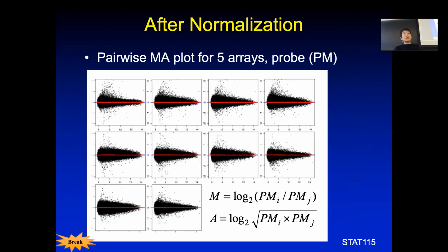Yeah, so questions? Yes. When we normalize across samples, do we need to have the same number of probes? Yes. With Affymetrix, the early Affymetrix and later Affymetrix arrays have different numbers of probes on the same array. Their locations on the array are also different, and depending on the location, their signals change a lot. People have tried to normalize against those different array types. We would not recommend that. Just the same type of array, different samples, you can do this normalization.